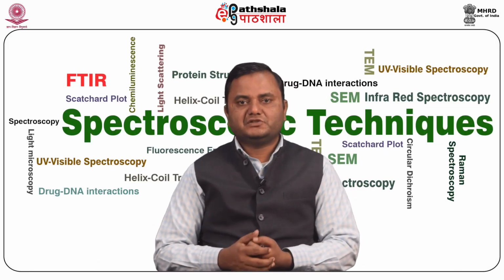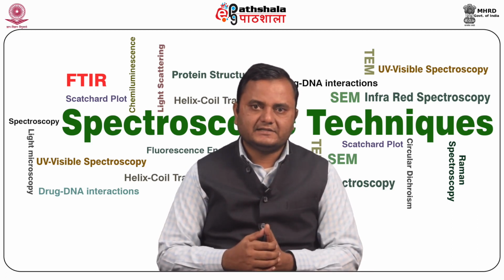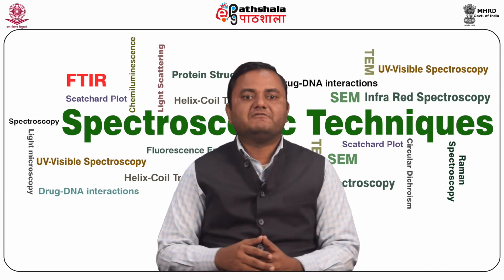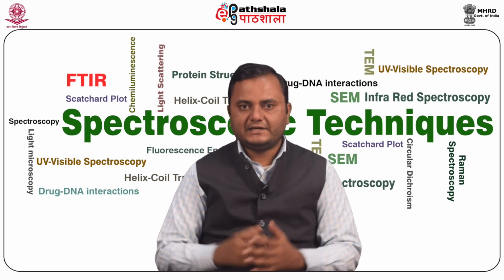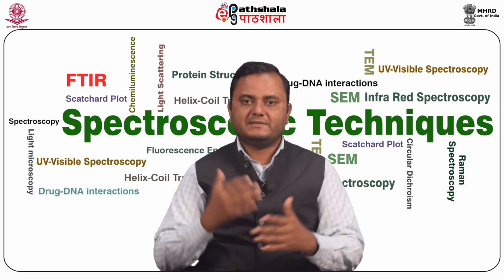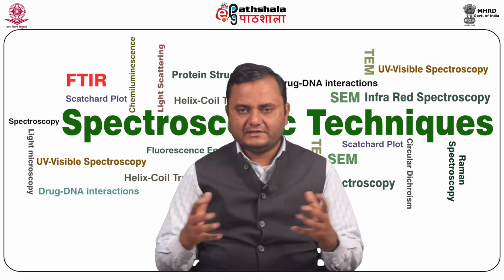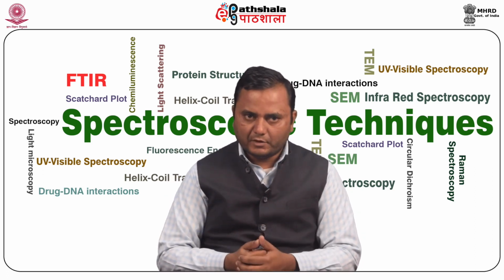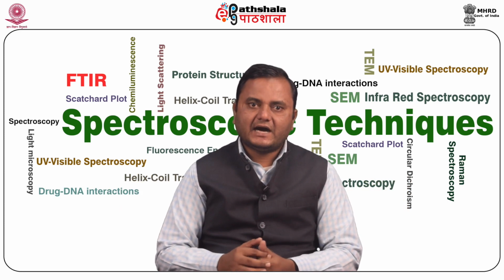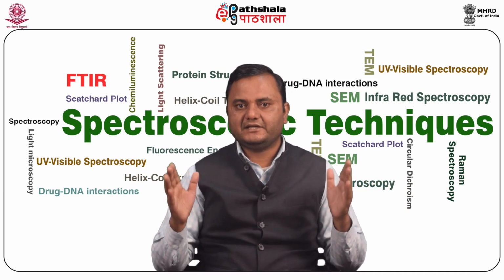Now we talk about the key functional groups by region of the IR spectrum. The energy of a photon in the IR region corresponds to the difference in the vibrational energy levels within the molecule. The vibrational energy levels depend on the types of bond and bond strength. As I discussed already, the type of bond means double, triple, or single bond, and the bond number decides the strength of the bond, and it also depends upon the groups attached to them. IR is highly useful to determine whether a certain type of bond or functional group is present in a molecule.